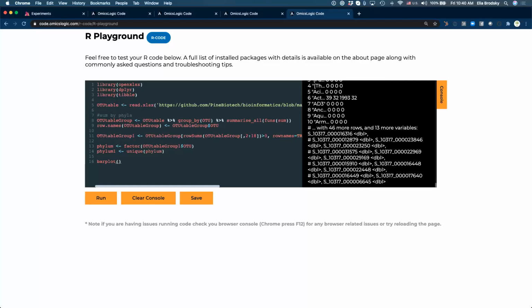So what are we going to bar plot here? What do you think we are going to use as our data for bar plot? Where's the data frame that I need to use? What's it called? Yep, OTU table group 1.